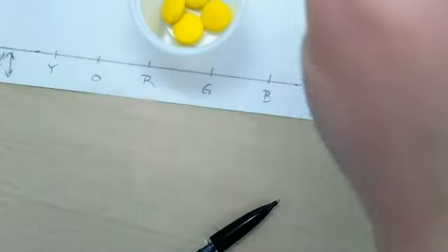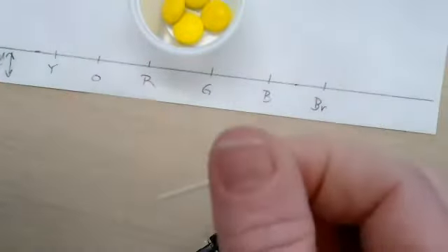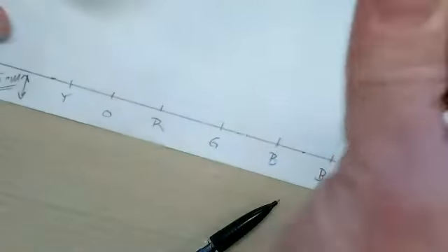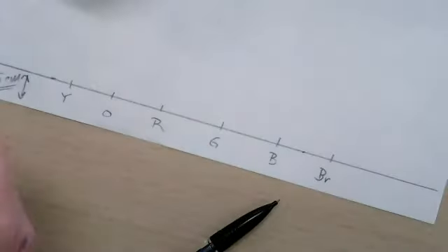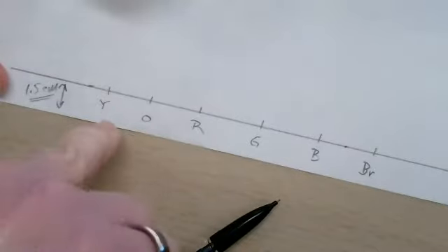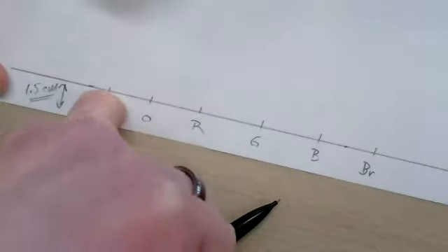And naturally, because the solution dye is polar, water is polar, glass is polar, it will naturally move upward and fill part of the capillary tube. So you'll pick up some liquid, and then all that you're doing is just touching it ever so lightly to the mark that you made.